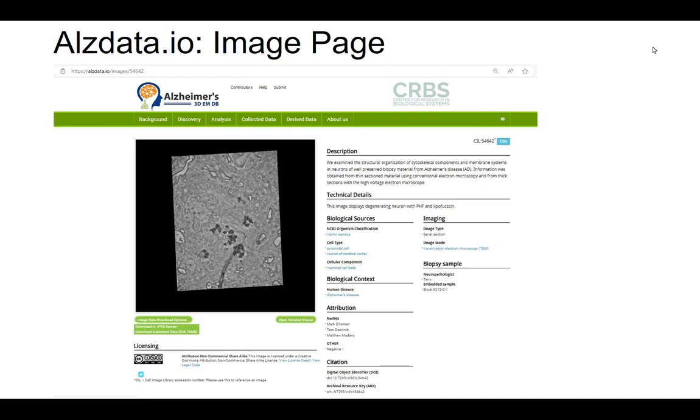Additionally, a Digital Object Identifier, DOI, is generated for every image, providing a unique and permanent reference that ensures the data can be easily cited and accessed. More importantly, all of our data is securely protected by the UCSD Digital Access Management System and preserved in the long-term digital archive, Chronopolis, ensuring its integrity and future accessibility.